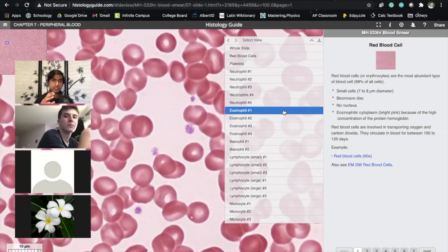Okay. And these are specifically circulating leukocytes or white blood cells that actually stay in the bloodstream as opposed to staying in the tissue. There are some cells that will sit in your skin tissue and stay there because they are effective when you get a cut, and you have a bunch of microbes in your cut, and you want an immediate response. By having that, the cells inside of your tissue can respond and immediately bring in all these leukocytes that we're looking at now. Leukocyte just means white blood cell. All these circulating leukocytes are in your blood.